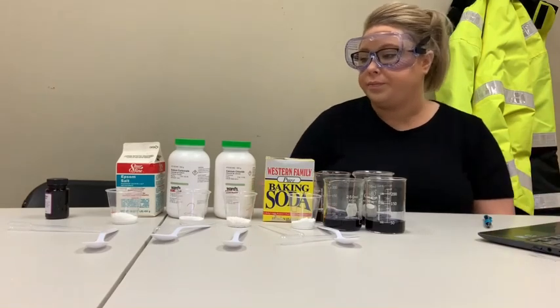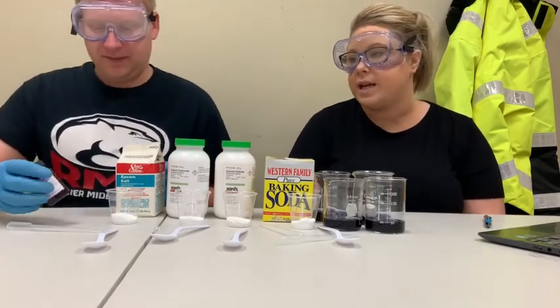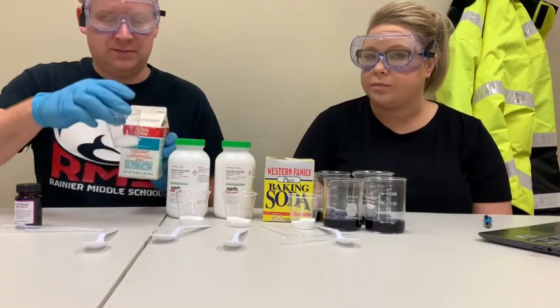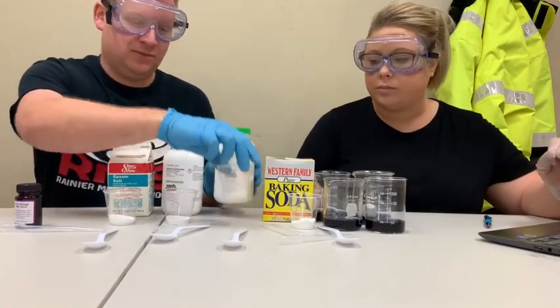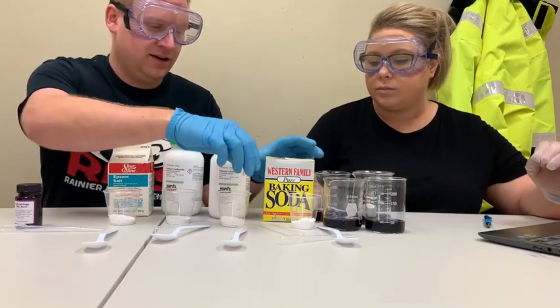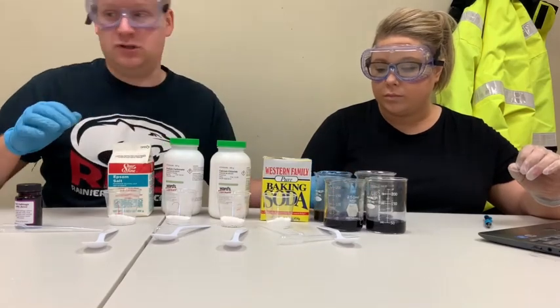And Mr. Olson's going to show us what materials we're going to be using today to investigate. All right, so we have our materials set up already. We have magnesium sulfate. We have sodium carbonate right here. We have calcium chloride. This is a big part of the reason why we're wearing gloves and protective gear. Here we have sodium bicarbonate. And then we have some cabbage juice right here.